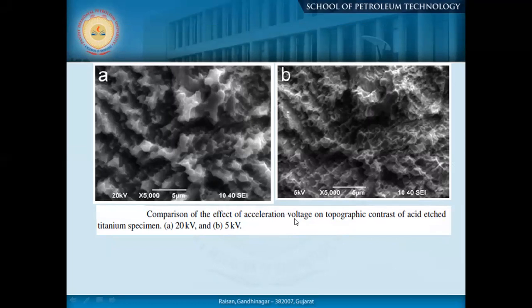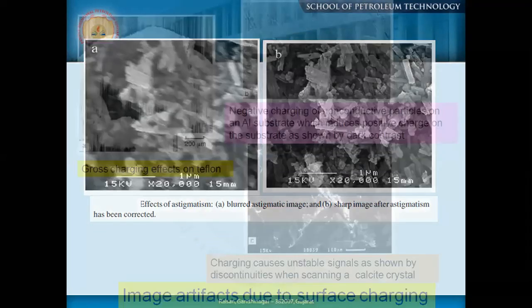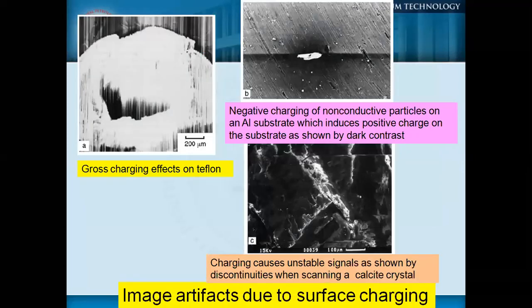Depending on your acceleration voltage, you can see how the image changes. If you have a conductive or non-conductive sample, you may have some sort of charging effect. For example, gross charging effects on Teflon samples — where you have a non-conductive sample — cause an unstable signal and visible variations in your image.